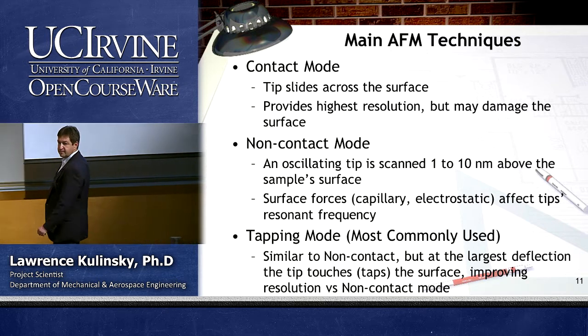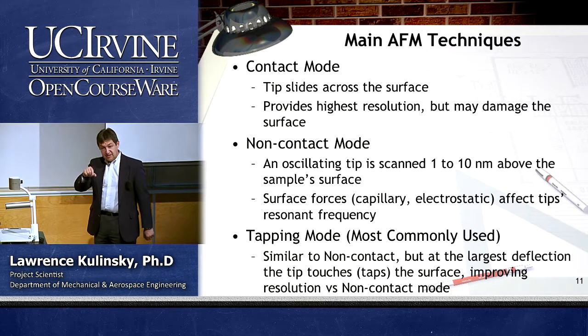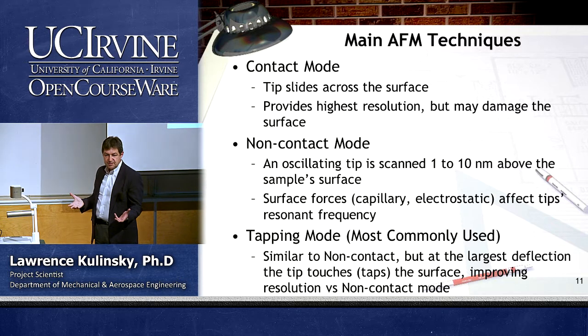So how often does it switch between the two modes? How often does it touch the surface? Well, it's up to the user. It's basically you tell it.